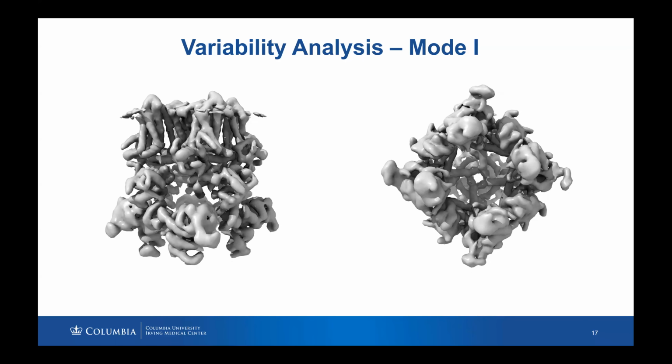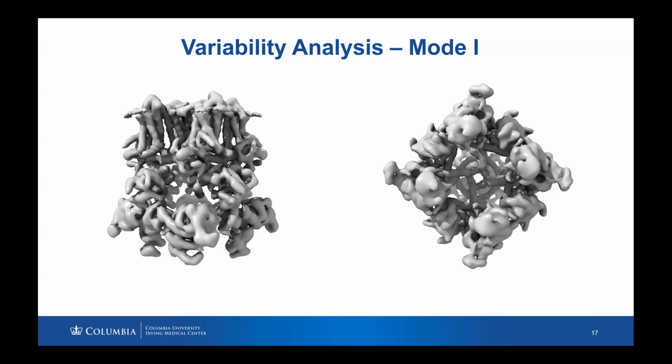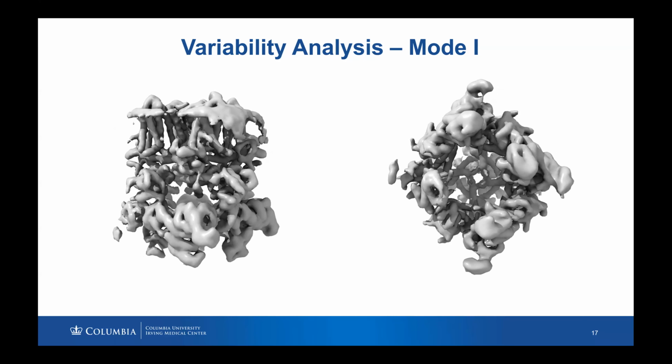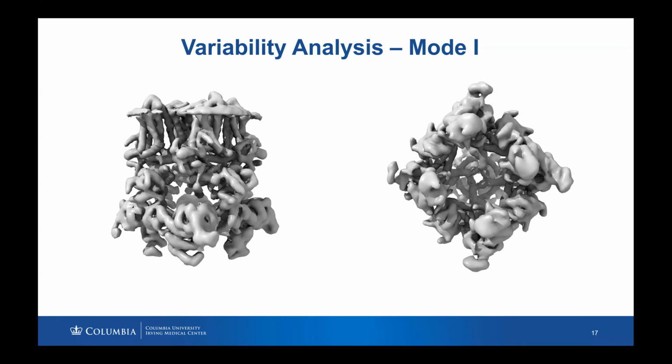Or is it just the fact that you tried to enforce C4, and this is what you get? C2 symmetry might do a little better than C1, but what's your take on the amount of symmetry that might be left over after C4 goes away?